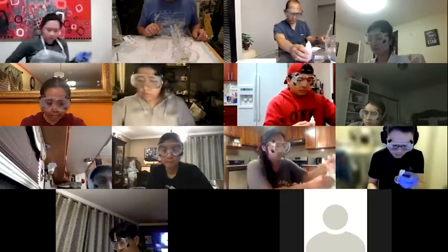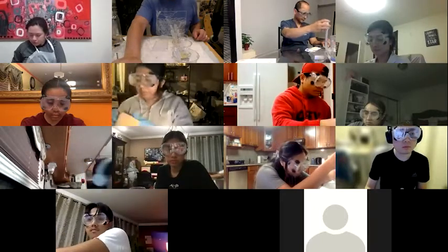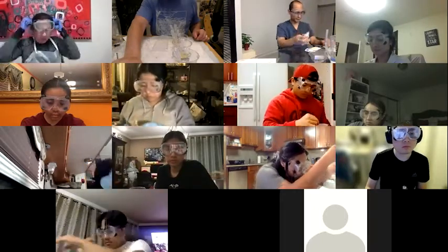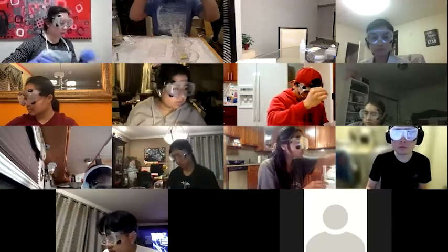And we want 1 mil for each. Okay. So it's a good idea just to sort of lay them out in a column like this in the same order. That way you don't get lost, because I get lost with this sort of stuff all the time.